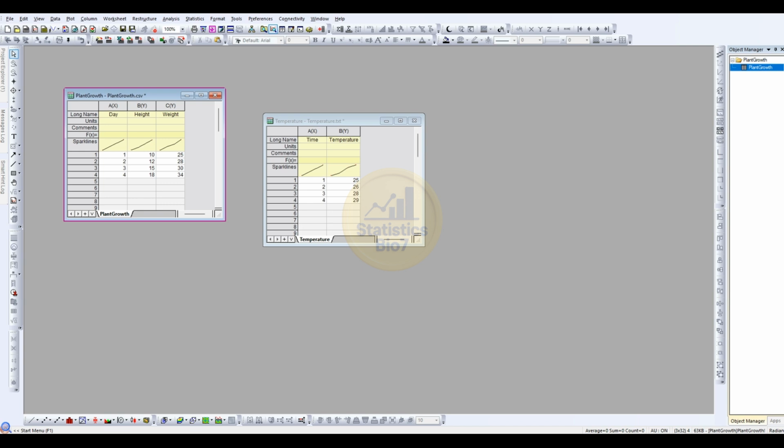For common text or CSV files, use UTF-8 encoding, an international format used not only for English but also for Chinese, German, Italian and other languages. Because most scientific units depend on the encoding, use the UTF-8 file format. In today's video you learned how to import CSV and text file formats.